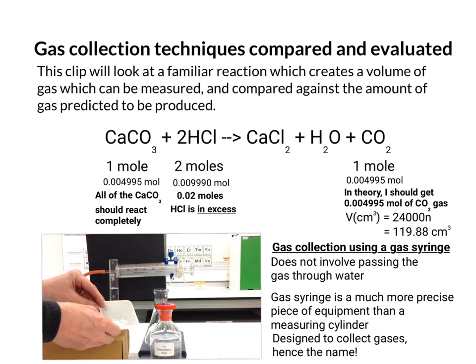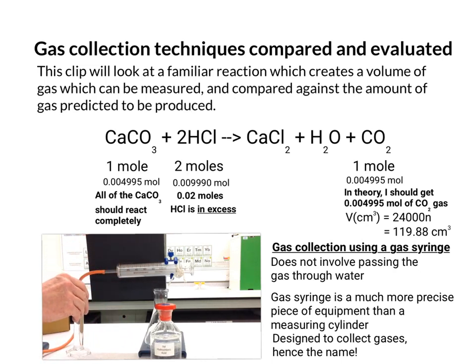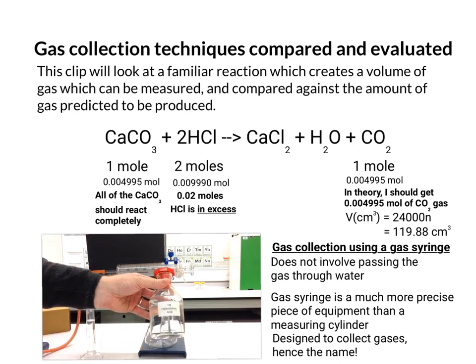So again you can see my sample of calcium carbonate. It was 0.5 grams exactly again. And against the black background you can see that the acid was measured to 20 centimeters cubed again. Exactly the same acid. One mole per decimetre cubed.